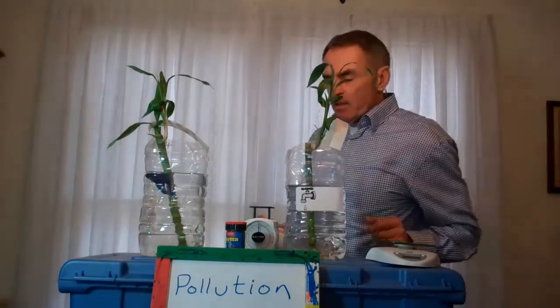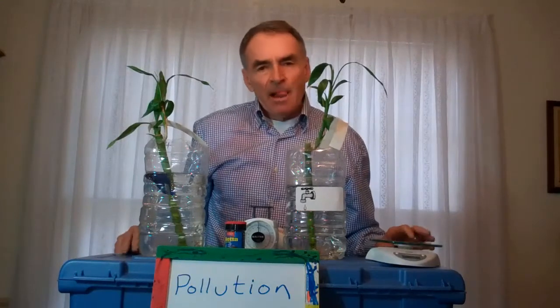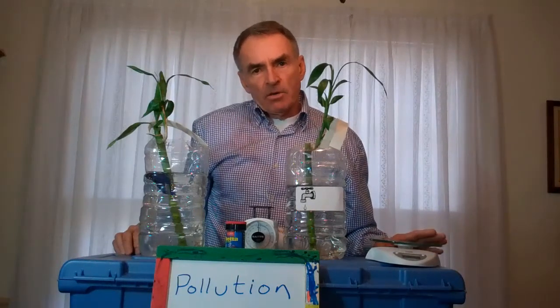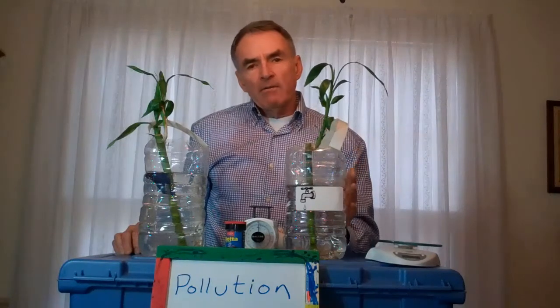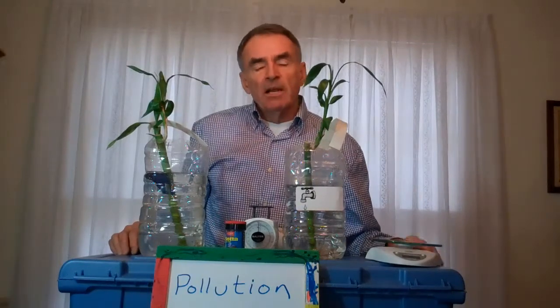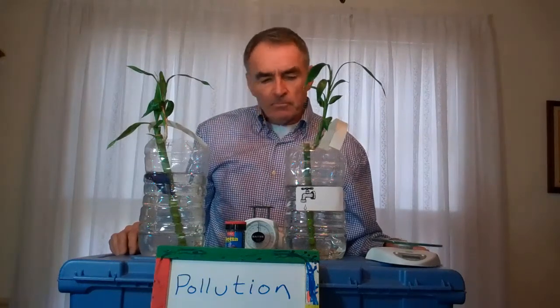So I'll have the students record that weight on the same data sheet that they used the first time around. It's important to safeguard those data sheets because they tend to disappear if you leave them with the students. And then I'll add those, and we will take that figure in grams, and we'll subtract from that the weight of all the plants in this vessel at the beginning, the sum of the weight of all the plants at the beginning of the experiment. And that will represent the change in the biomass weight over the course of the experiment.